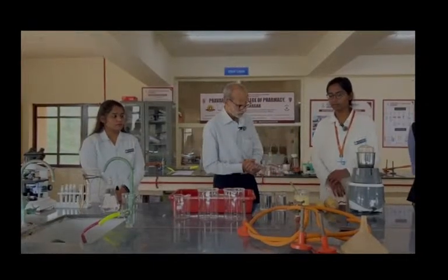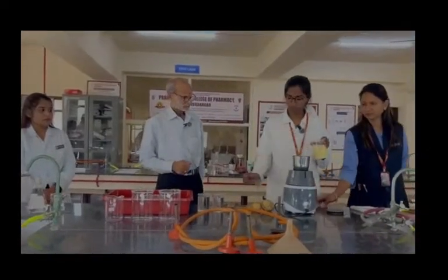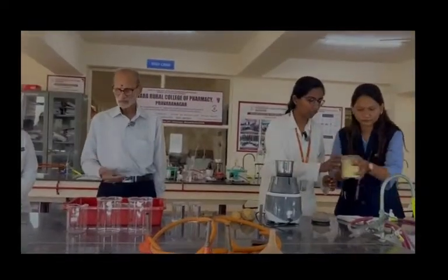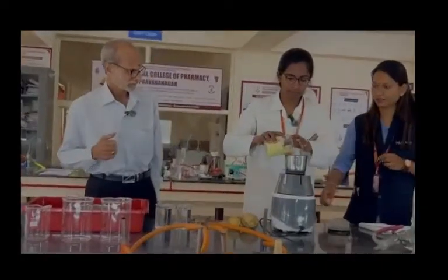So Bhakti, please start with it. We have the peeled potato pieces; put them in a mixer. And once we have the starch, we will identify that starch both chemically as well as microscopically.